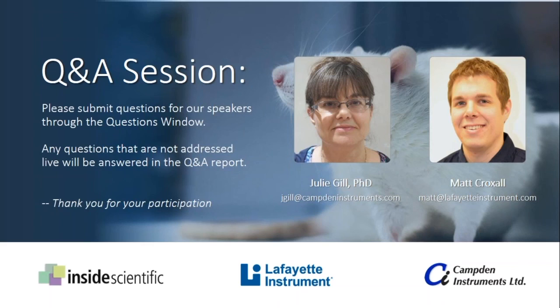Are there any specific use and care instructions when it comes to either cleaning or avoiding damage to the equipment by the animal itself? Can either of you talk about that? Yeah. Do you want to take that one, Matt? Certainly. The cleaning, most of the components come apart, and so it's built in a modular fashion to make it as easy to clean as possible.